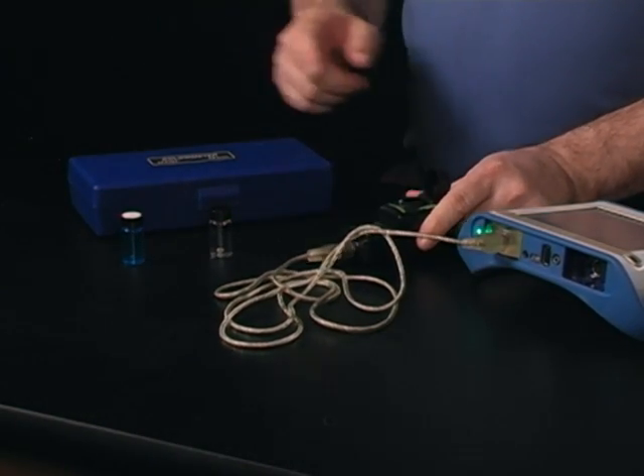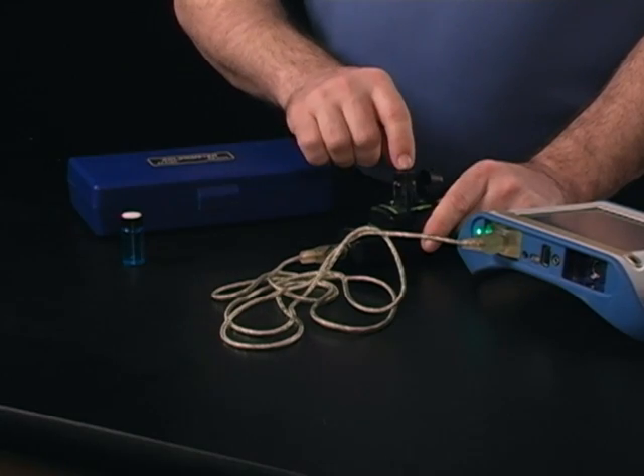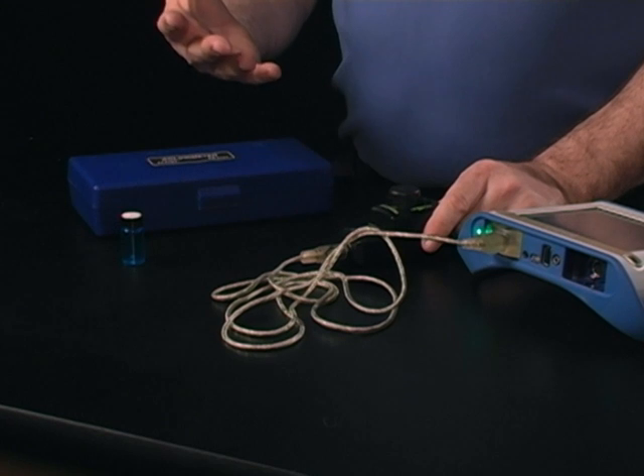I'm going to pop the top here and I'm going to take one of the cuvettes that comes with the colorimeter, put distilled water in it, and place it into the device. I'm going to make sure that cuvette is nice and clean and doesn't have any fingerprints on it. I'm going to close that hatch so it's nice and light tight.